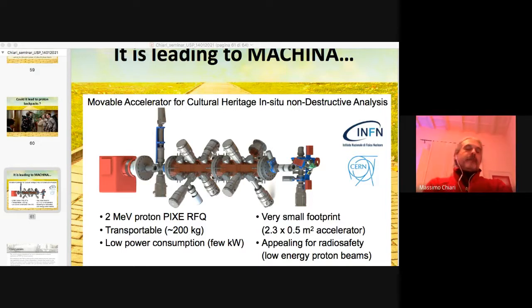Okay. XRF spectrometers are widely used in laboratories for the analysis of aerosol filters, because they are turnkey instrumentation. And we also have one in our laboratory, and we will also soon procure another one, because, as I've said before, in our role as calibration center for elemental analysis of aerosols with techniques like XRF, PIXE, ion chromatography, ICP-MS, we need to have the possibility to test different instrumentation that can be used in the laboratories.